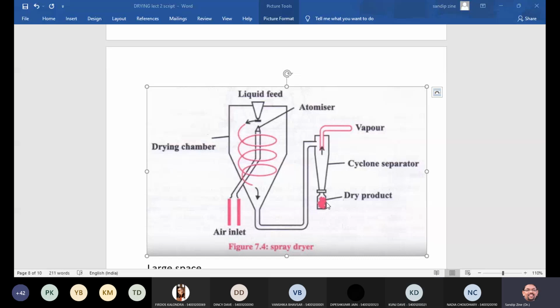Yes, sir. Sir, speak. In the drying chamber, the surface of the drying chamber is in contact with the air only. Not a single droplet is in contact with the drying chamber because it is in the space between the walls of the drying chamber. Yes.